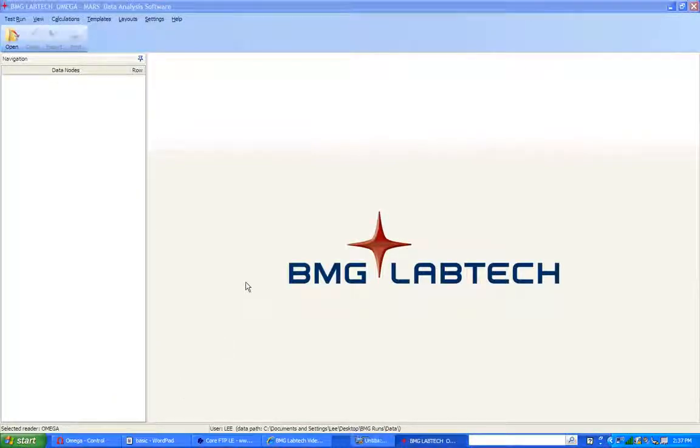Okay, this video is going to show you real quickly how to take the test runs off of the BMG Reader computer and export them out onto a thumb drive or your network drive and put them onto your own computer for analysis outside of the reader.